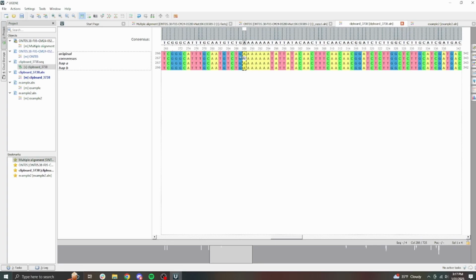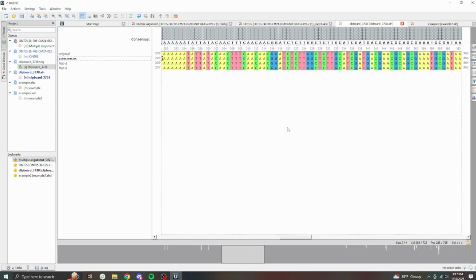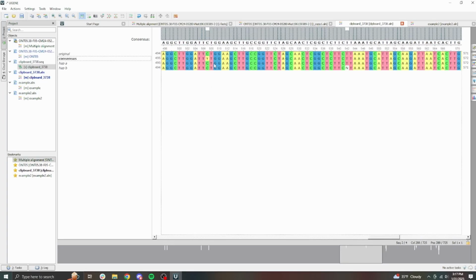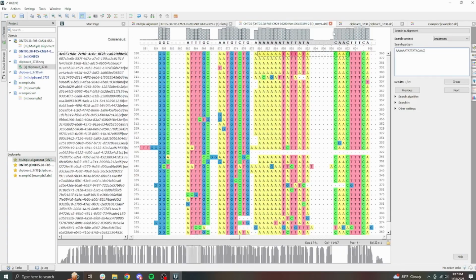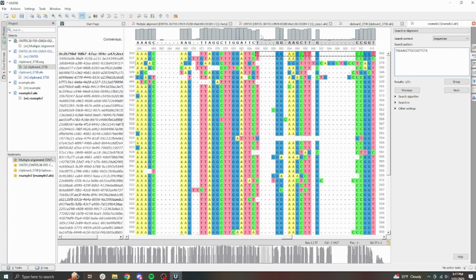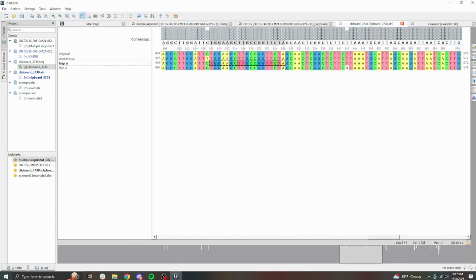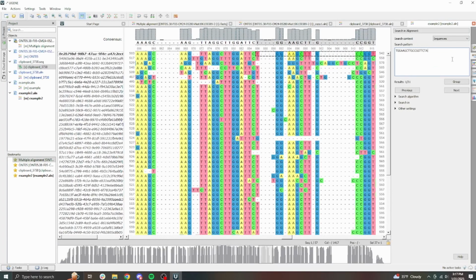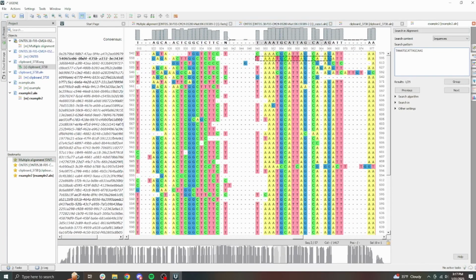We'll just get rid of that and make that an A. I'm guessing, like I said, with that initial alignment, that Lacaria chunk that was in there was causing some issues. But yeah, we're just going to keep going through this and checking them.